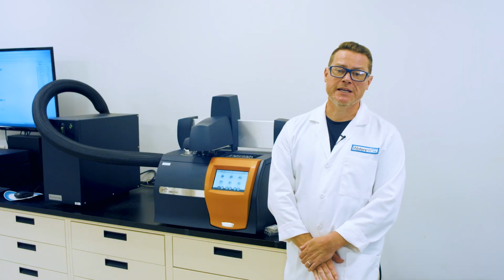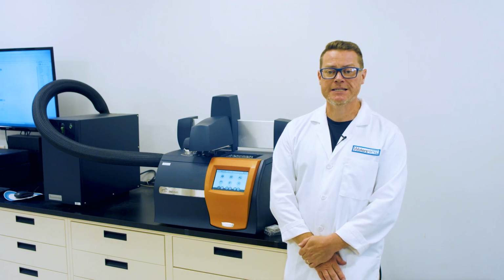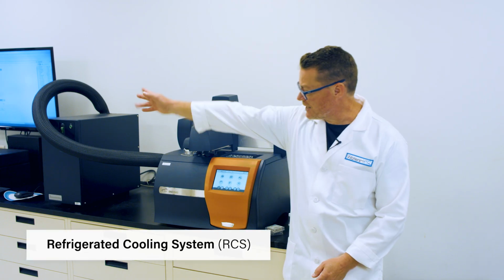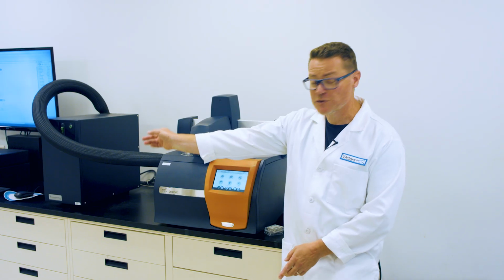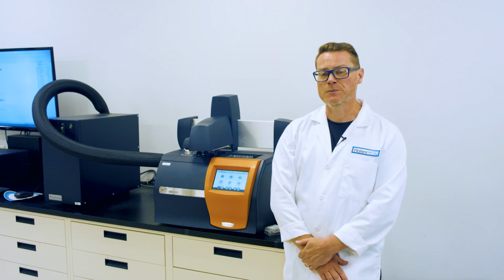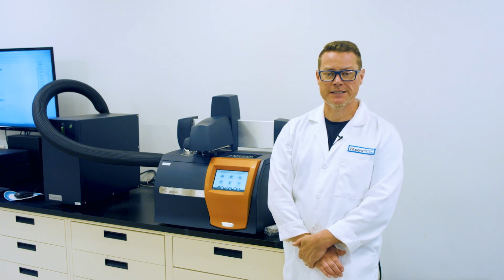DSC instruments also need to be able to lower temperature. This can be done by simply turning off the furnace, but to achieve faster cooling rates, many DSCs have active cooling, typically with a refrigerated cooling system, RCS, like this, or they will circulate liquid nitrogen. TA Instruments offers 3 RCS systems, which cool to different temperatures. This one cools to -90 degrees centigrade, while liquid nitrogen cooling can achieve -180 degrees centigrade. Which type of cooling you use will depend on the types of material you want to study.